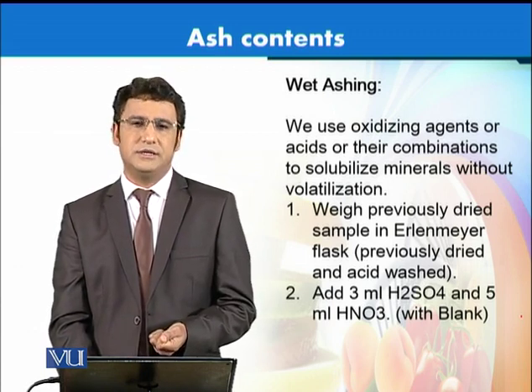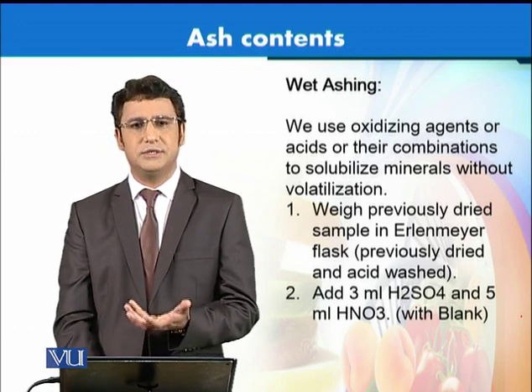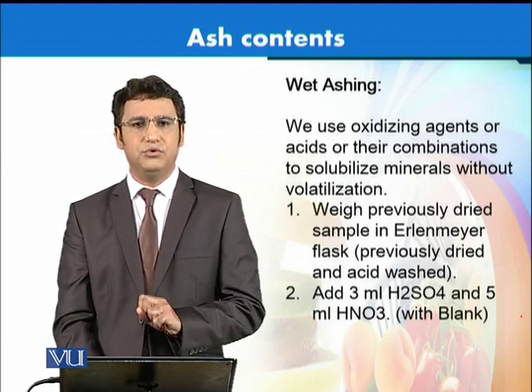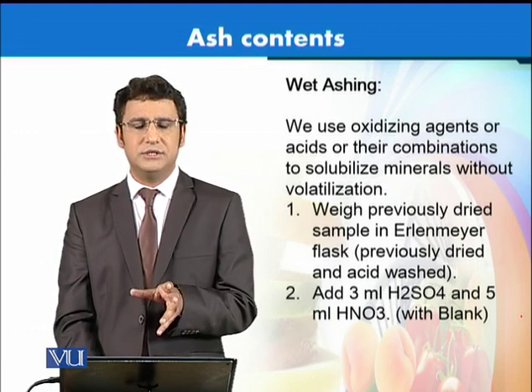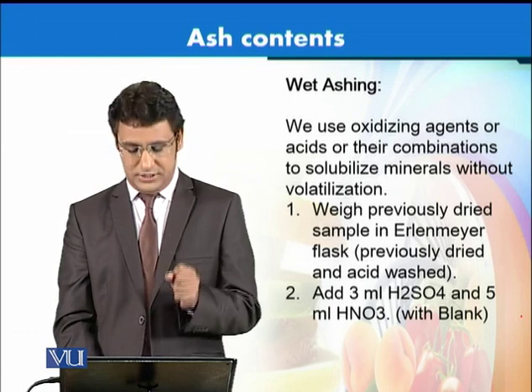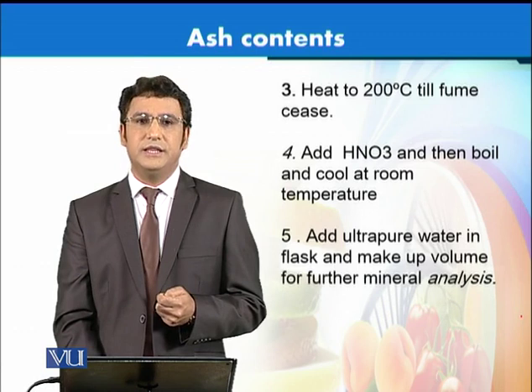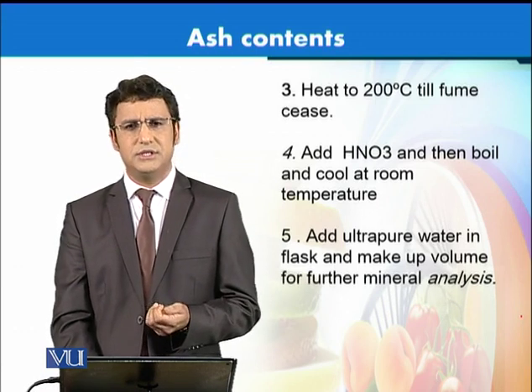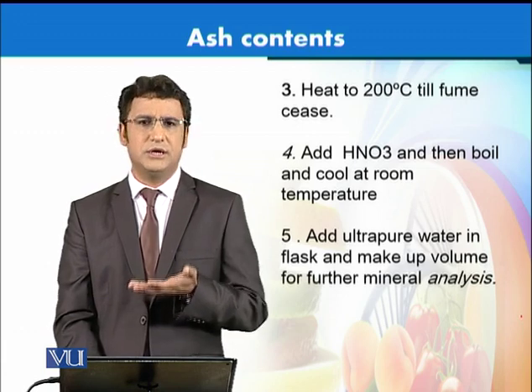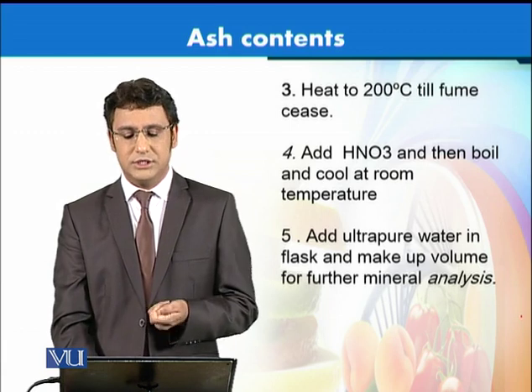And as in other analysis, we have to use a blank sample as well. The blank sample is a sample in which we are not adding food, but we are adding all the other reagents, and we are treating this in a similar way to the flask with the food sample. Then this is heated at 200 degrees C. As you see, we are not heating at 500 degrees C. The heating temperature is not that high. So we heat this solution at 200 degrees C.